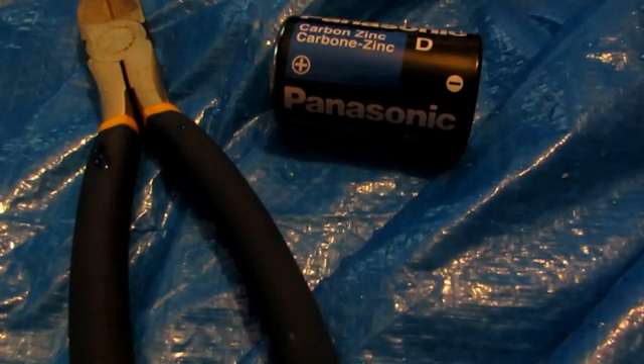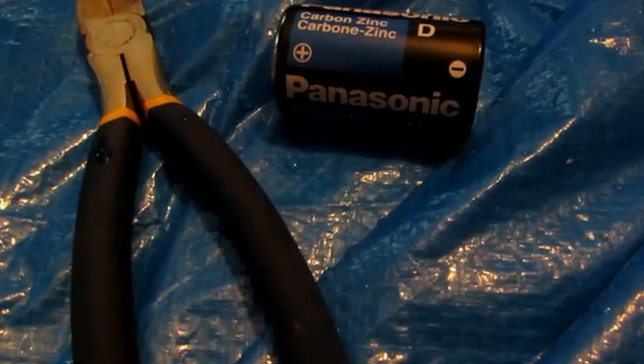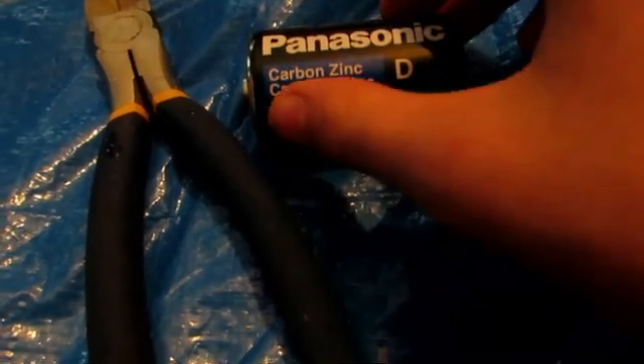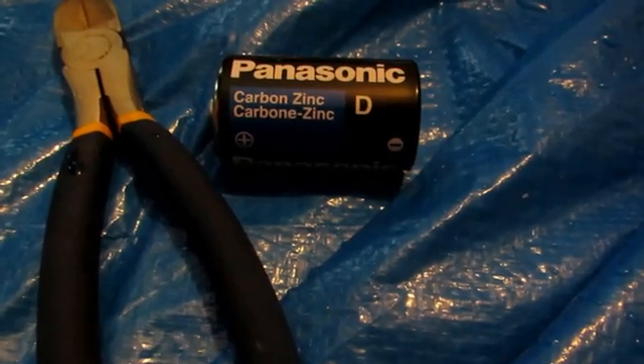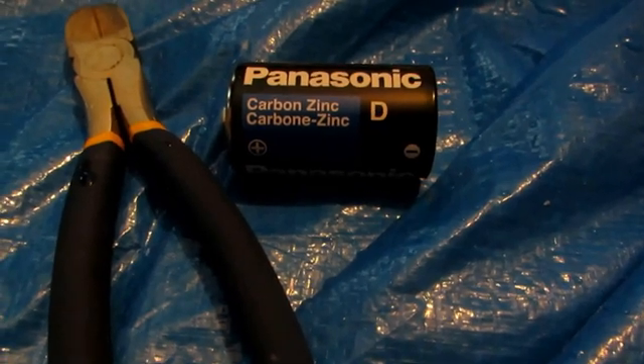Hey guys and welcome back to how to make elements from household materials. Today's element is going to be zinc. Now zinc can commonly be found in these carbon zinc batteries — you can see it says carbon zinc on it. Make sure it says carbon zinc. If it says anything like alkaline or super heavy duty, you don't want those because they will not contain zinc metal inside of them.